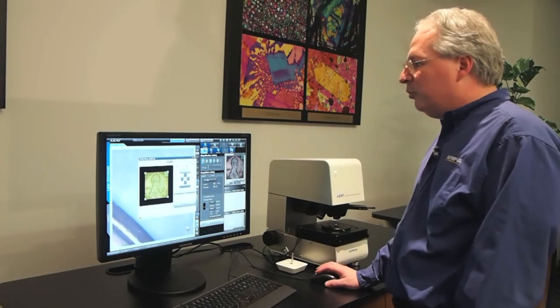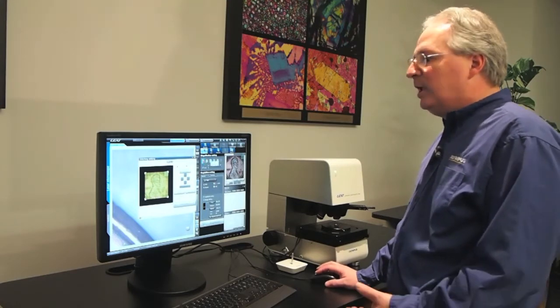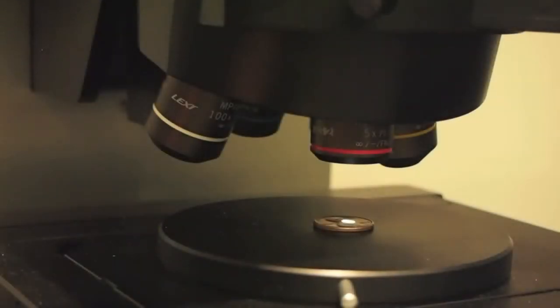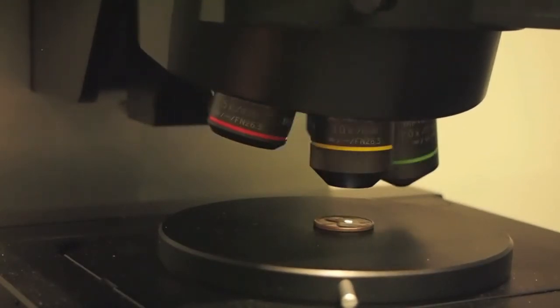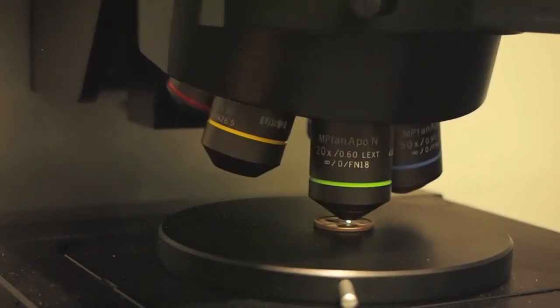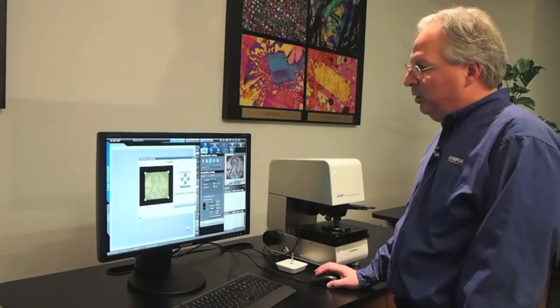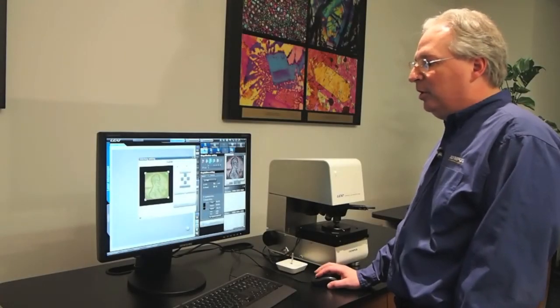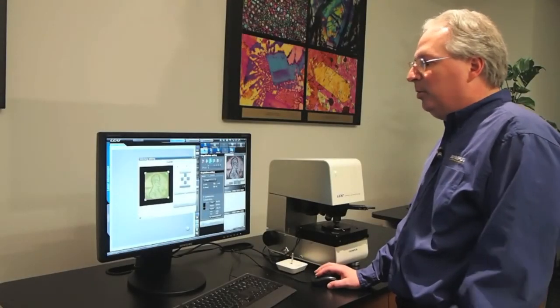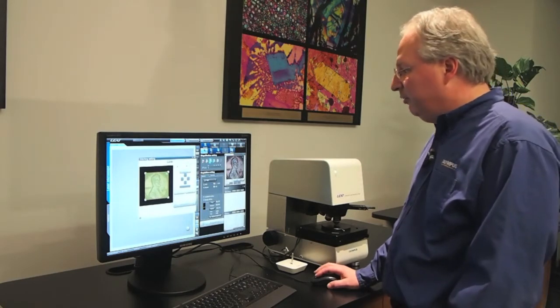Let's move up to our 20x objective to get more detail. With that narrower depth of focus, we'll get more height data in our image. We can now see these image frames are much smaller, but we'll definitely get more detail.